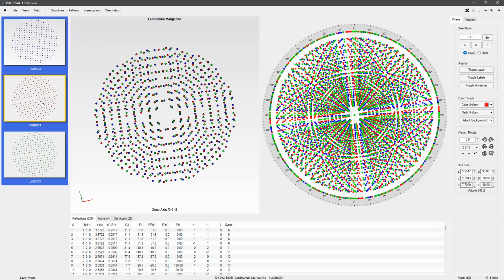So this would be a multi-phase simulation, right? And instead of just duplicating a phase, you could also add another structure file, CIF or CSF, or add another PDF number to import that. It will be part of the project.